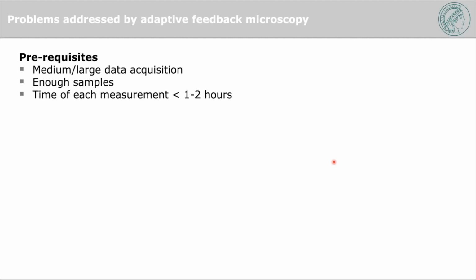There are certain projects where your sample is very precious. So we have projects that run on human tissue, live, maybe some oocytes where once in a month you get one. And this you will not run with this kind of workflow because it's just too precious, in case there's some bug or something not working. So the user will sit in front of a microscope and run the experiments to get the best possible data they can.